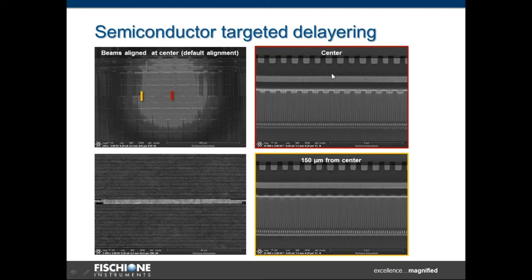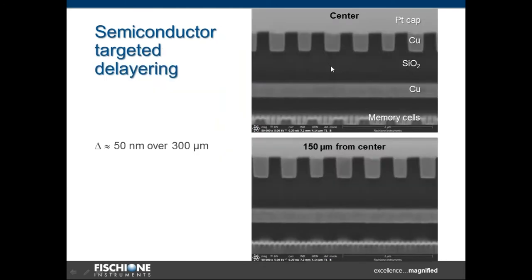So, we did a cross-section, FIB cross-section in the center, and one in the extreme of the milling area. You can see the cross-sections are very uniform, very similar. And if you look closer, you will find the uniformity of the milling is 50 nanometers over 300 microns. So, it's very nice and clean, the targeted delaying process.